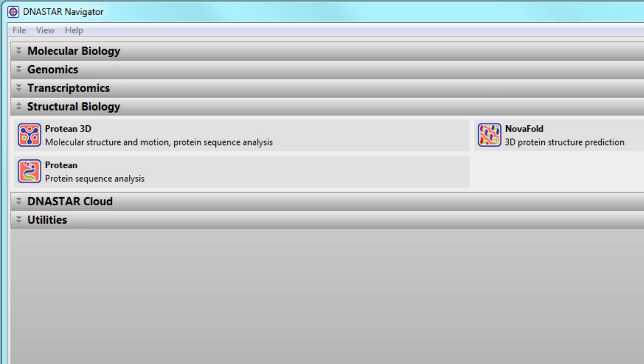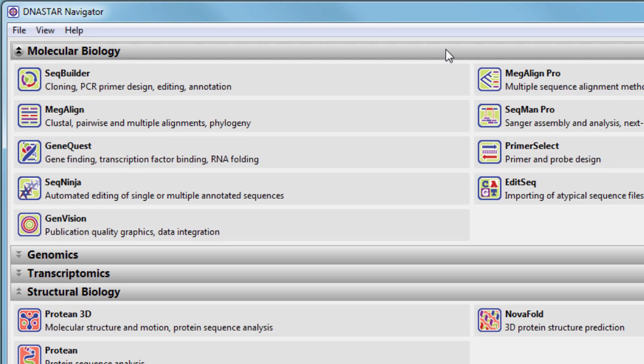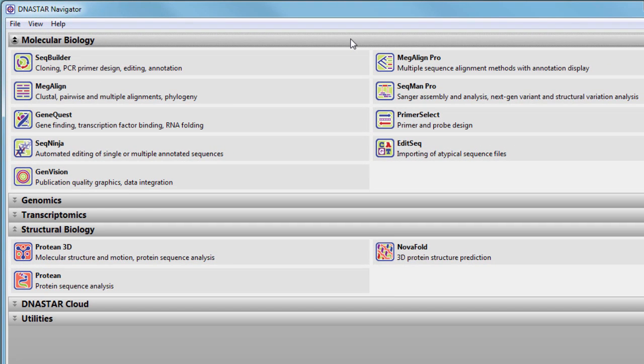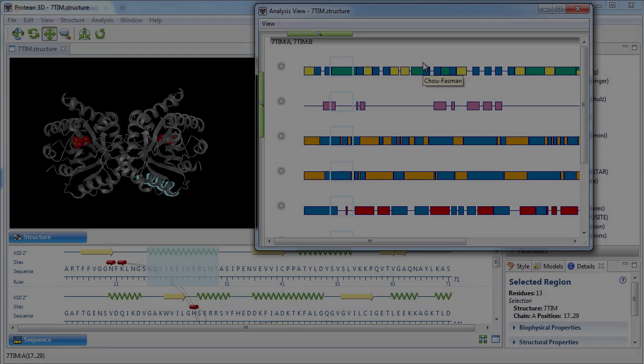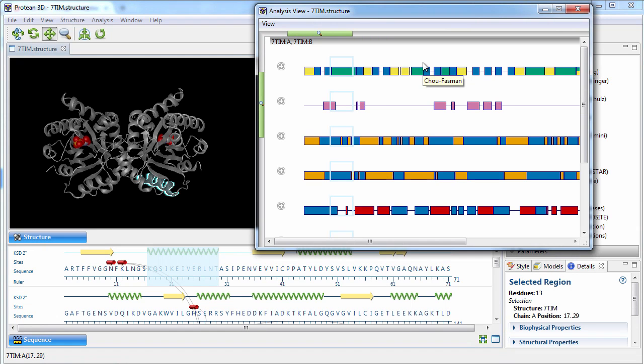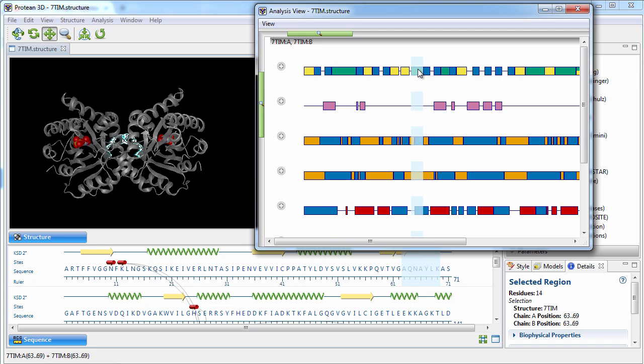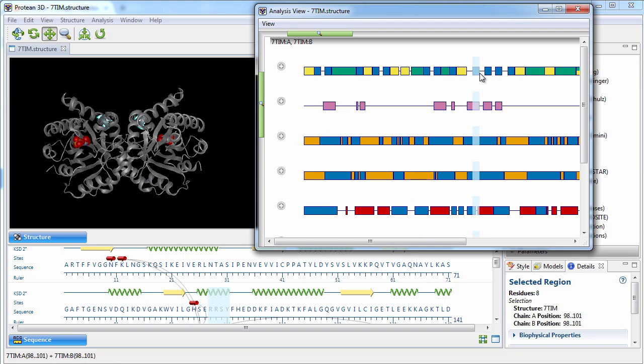The suite also includes access to our molecular biology software for protein and DNA sequence analysis. At the heart of this suite is Protein3D, which includes interactive views that allow you to view macromolecular sequence, structure, and prediction methods simultaneously.